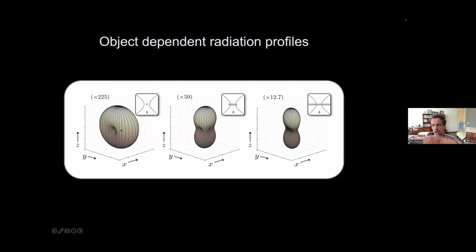It is actually just the radiation of a single point dipole, okay? That's what you get. But in microscopy, we never have typically one molecule that contributes to the signal. We get many, many more. So what if those molecules are oriented or structured in this kind of film right here, this kind of thin film across focus? Then you see something like that, okay?